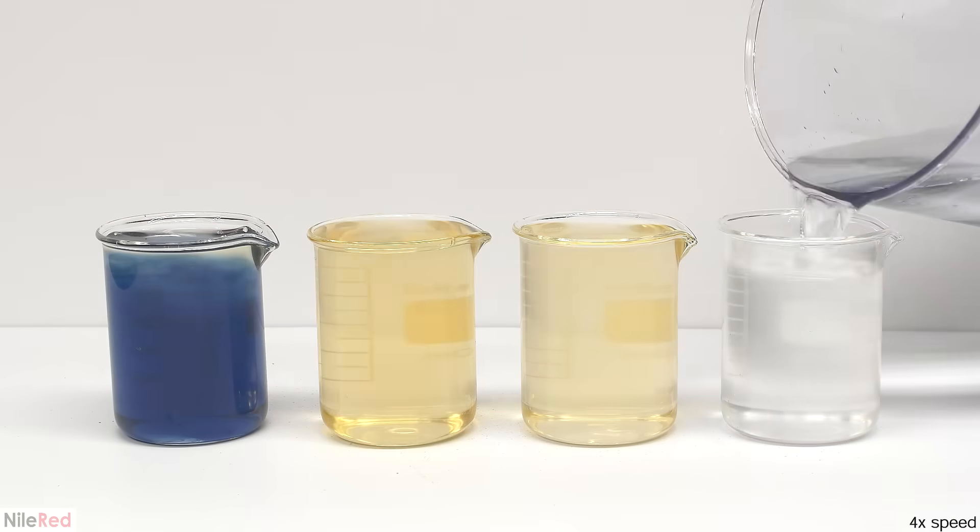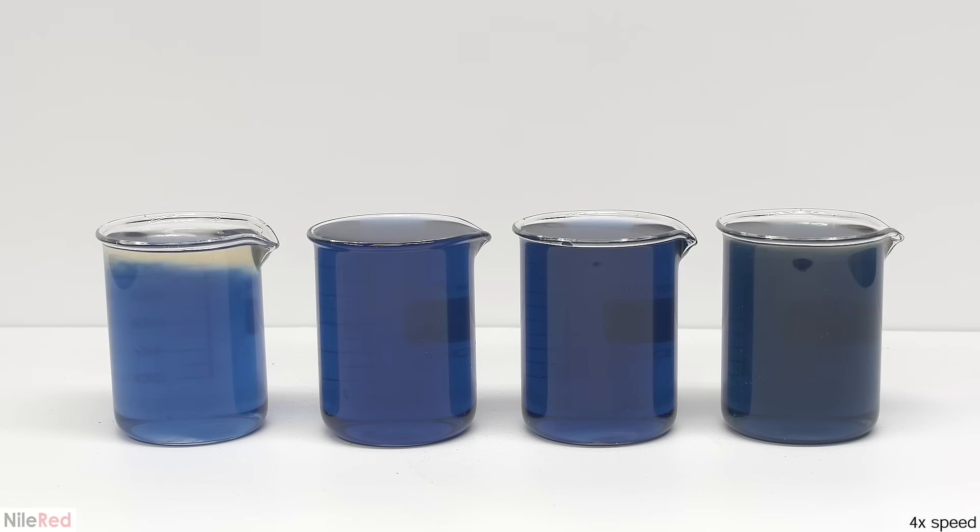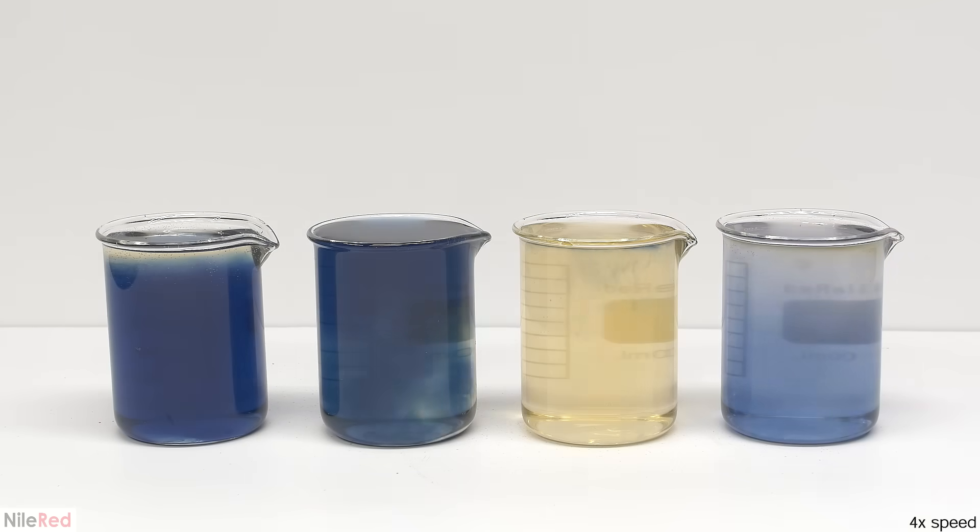For the last run, I sequentially added the solution to four different beakers and I'll play it back in four times speed.